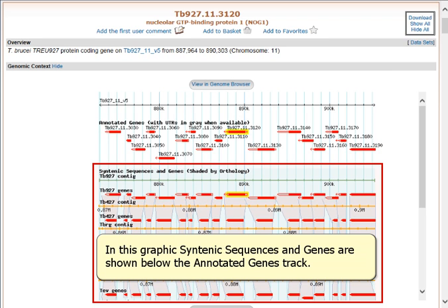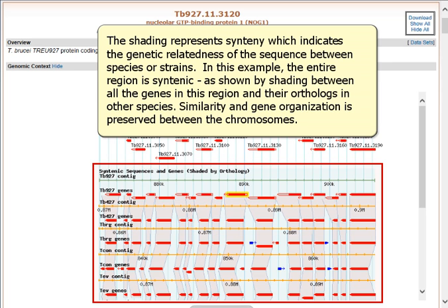In this graphic, syntenic sequences and genes are shown below the annotated genes track. The shading represents synteny, which indicates the genetic relatedness of the sequence between species or strains. In this example, the entire region is syntenic, as shown by shading between all the genes in this region and their orthologs in other species. Similarity and gene organization is preserved between the chromosomes.